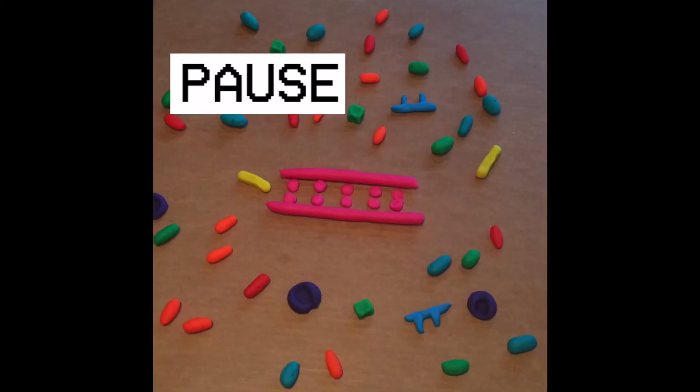This reaction is a modified PCR reaction called chain-terminating PCR. This is all happening in a nice solution of other DNA copies, free-floating nucleotides, the oval shapes, DNA replication enzymes, the purple and yellow pieces, and these special molecules called dideoxynucleotide triphosphates, or DDNTPs for short, which are the squares.